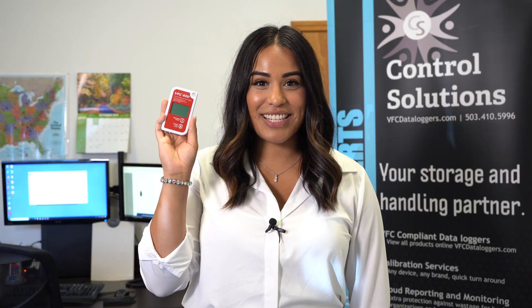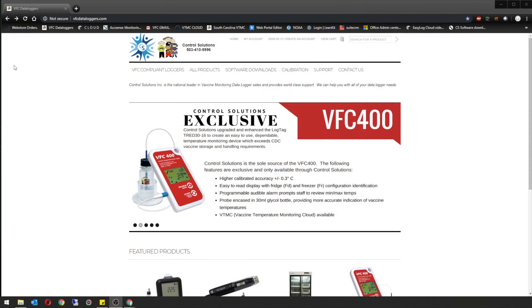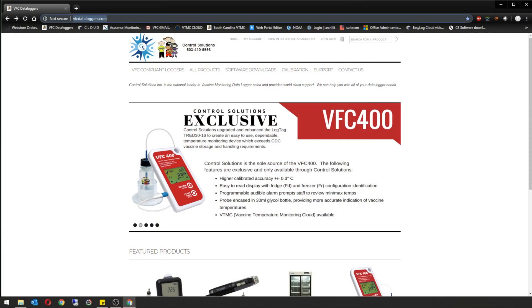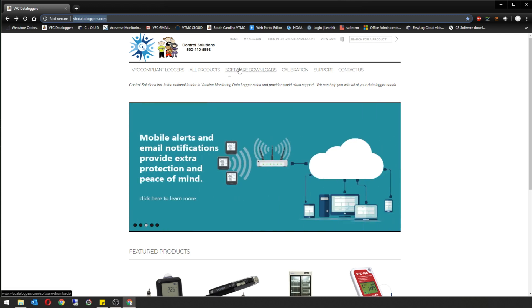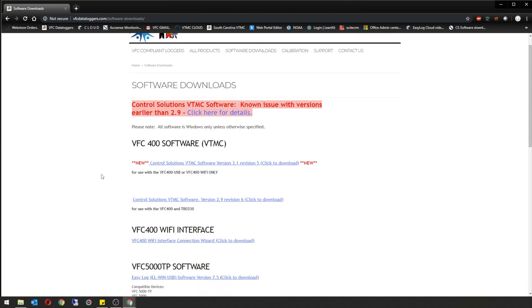Thank you for purchasing the VFC 400. Before you can start using this data logger, you will need to download the Control Solutions software located on our website. Once you're on the home screen, select where it says Software Downloads. You're going to download the Control Solutions VTMC Software 2.9 Revision 6.